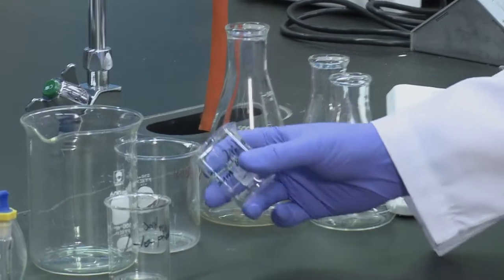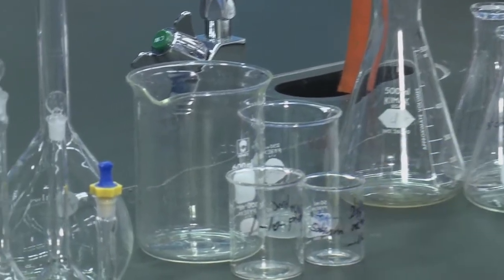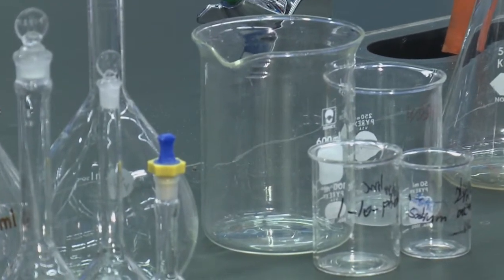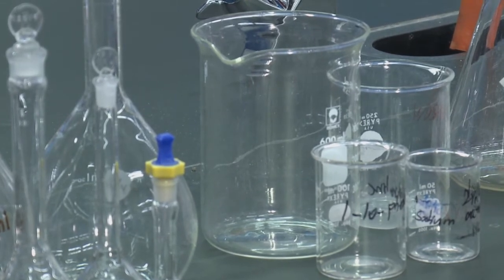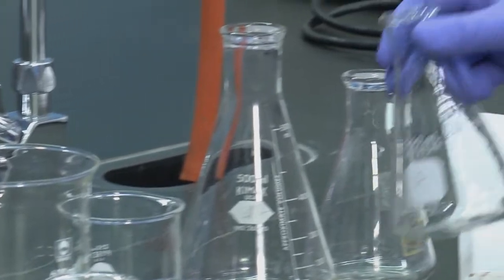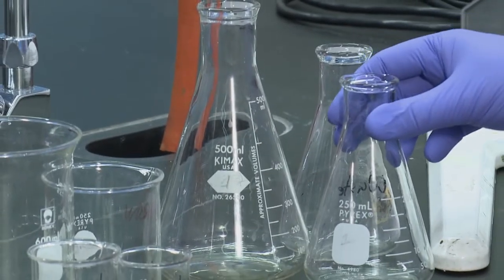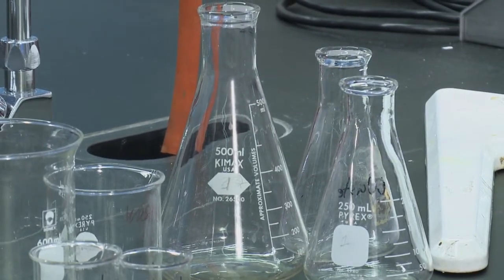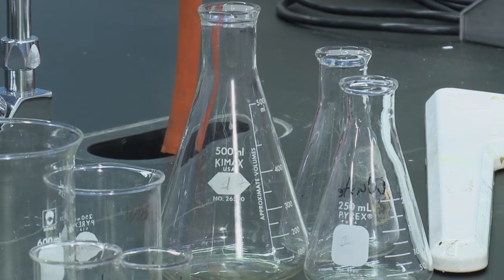The next glassware you'll use commonly are beakers. They are just for holding volumes of liquid but not for specific accurate measurements. Likewise with your Erlenmeyer flasks which are often used for titrations. They are not to be used for accurate volume measurements.